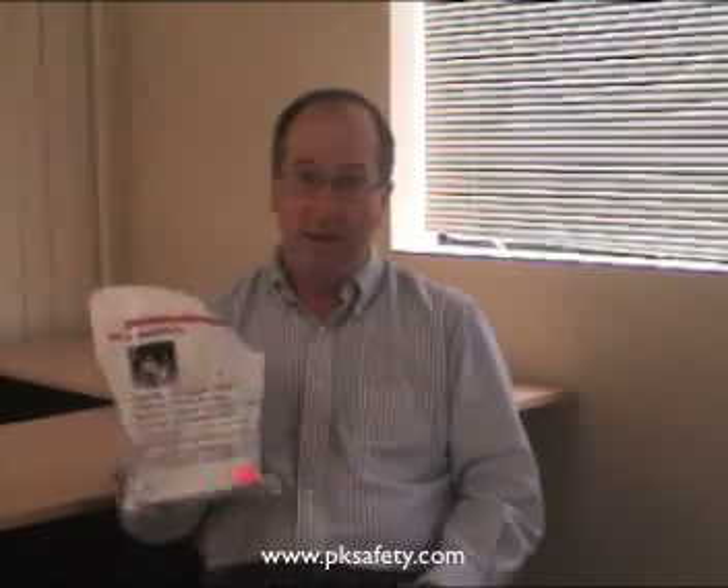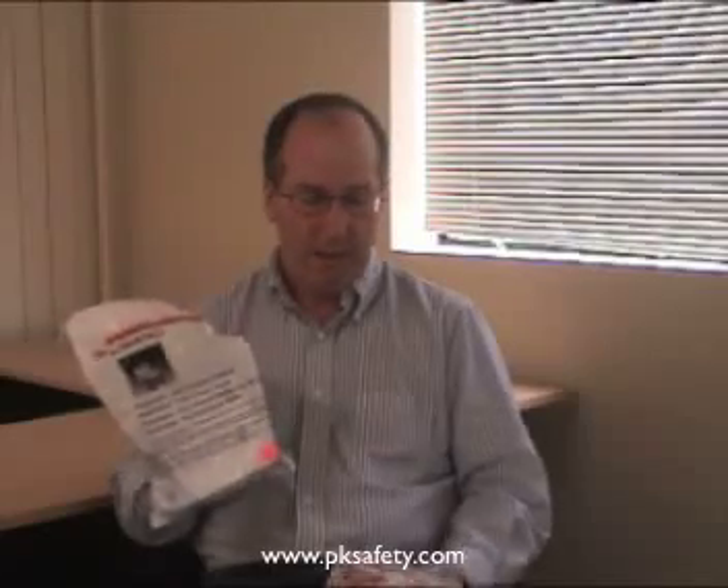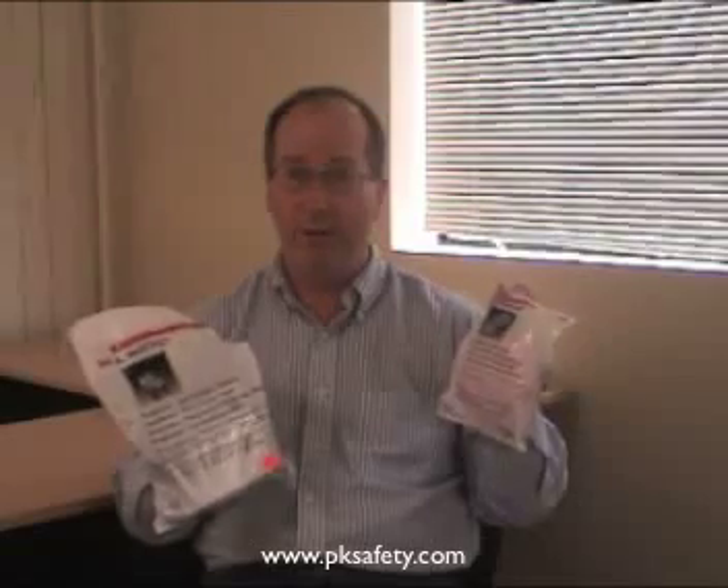What this consists of, which you'll get in the box, is a 3M 6000 series half mask respirator, which we'll look at in a second, and the 3M 2091 or P100 filter.